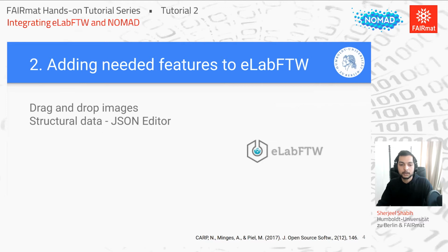But we also needed to upload metadata captured by the acquisition software, and placing that into rich text is possible. But if anyone who's editing the experiment by mistake misspells the field name or erases a pre-generated field name, we lose our parsing abilities, and then we have to check which experiment has that bug and fix it and whatnot. But with something like JSON, it really helps give some structure. So this is another mod we added.